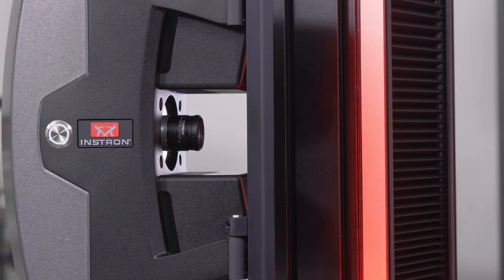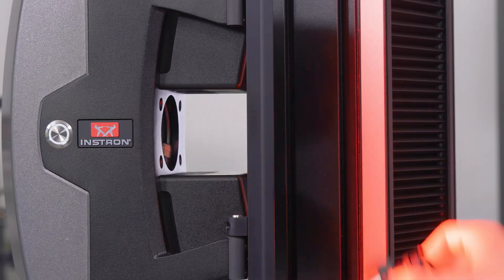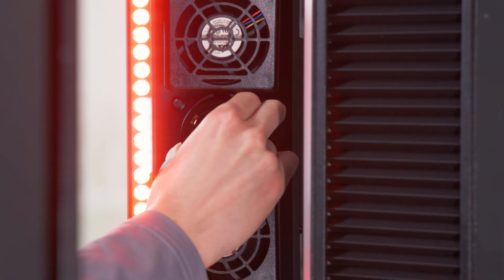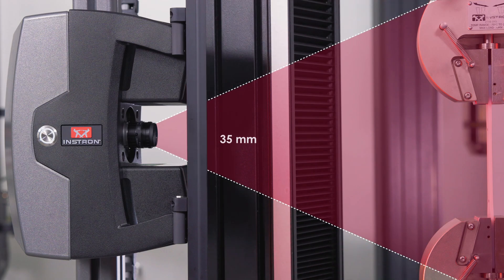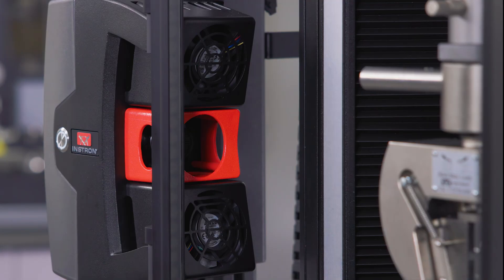Making it easier for operators to perform periodic calibration checks to ensure the extensometer is dialed in and ready for testing. The AVE platform adapts to your testing needs, allowing you to quickly change out the lens to accommodate a wide variety of gauge lengths and elongations. With the new kinematic mounting, lenses automatically snap into the factory calibrated location.